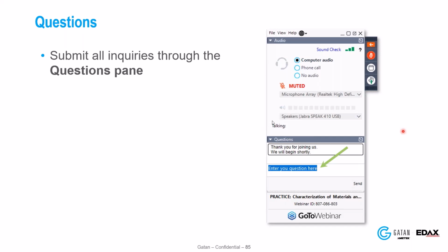There is a question, does it take too long to re-index after the scan? Like NPAR, depending on the scan parameters, it could take hours. Whether it takes too long is a personal determination. There is a reprocessing time involved, and certainly as I was preparing for this, when you have million-point scans, it takes a lot longer than when they're 1,000-point scans. And again, depending on the data quality you need, is it worth that time to spend?